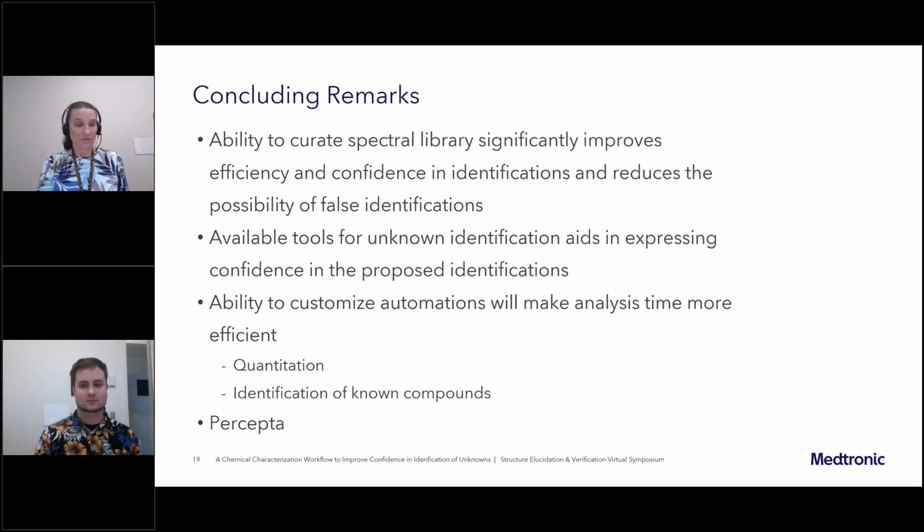And finally, we are planning some expansions. This project started out for LCMS, but we have expanded it to our GCMS data as well.